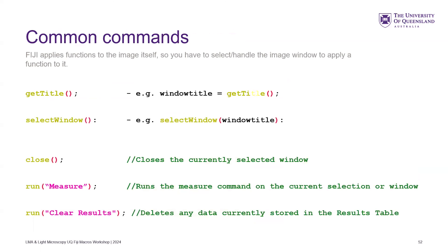Some common commands: get title. I like to use this as `window_title = getTitle()`. And then you might say `selectWindow(window_title)`. Say you opened an image called control.tif. After you max project it, Fiji is going to call that new window MAX_control.tif. So if I wanted to go back to my original image, I could select whatever that title is. I could make a new variable called window_title_after_max and run that same command and click it later. When coding with macros you have to imagine in your head what's happening in Fiji and which window you want to be selecting.